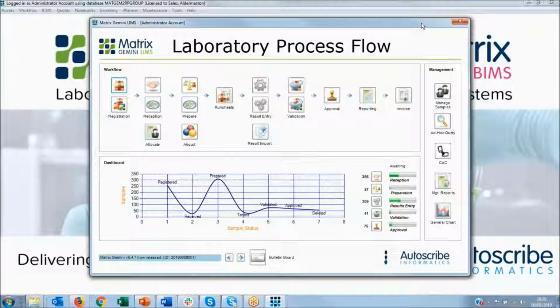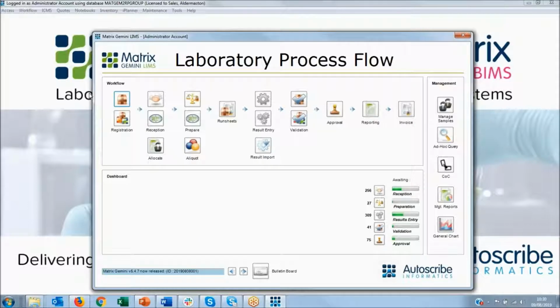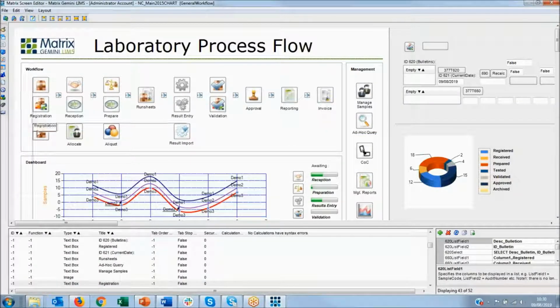So let's go out of this section and go back to the top level. Now perhaps I wanted to generate a second registration screen which is slightly different to the first. That's perfectly possible in this flow. You might have different types of registrations. So what I'm going to do here is put a separate button in here for slightly different registrations. So I'm going to put this down here, and I might call this Alt or something like this.